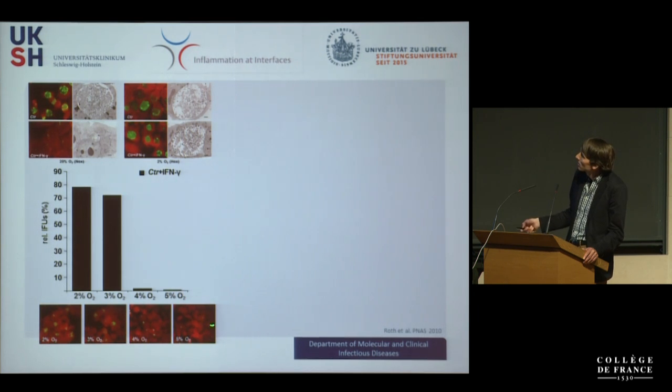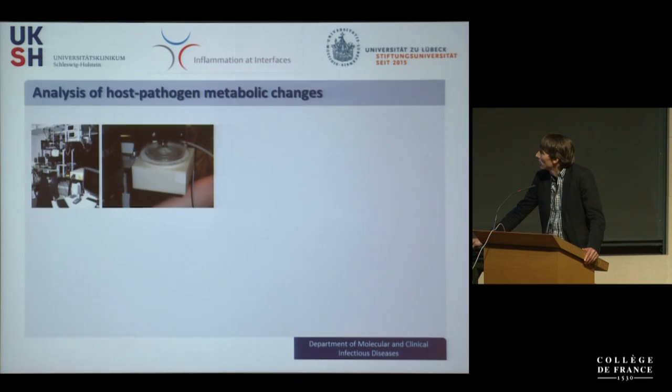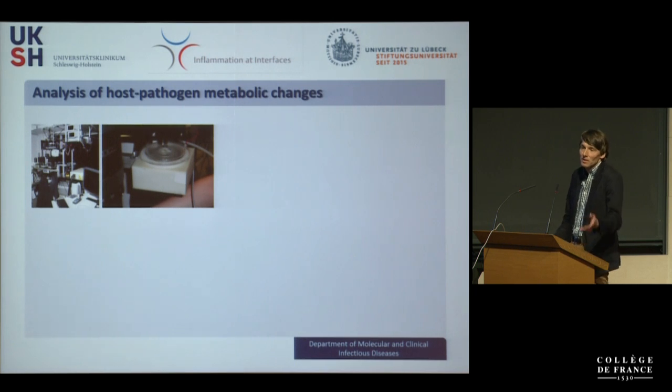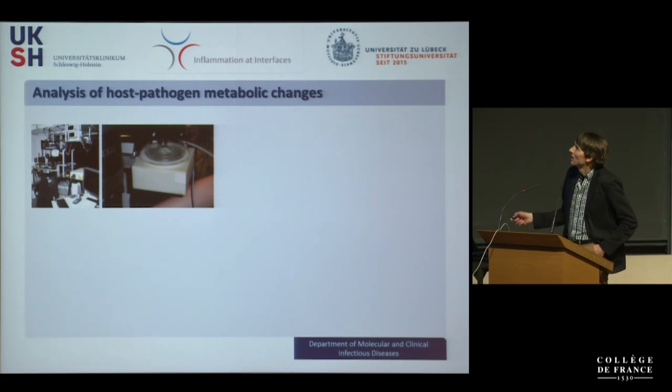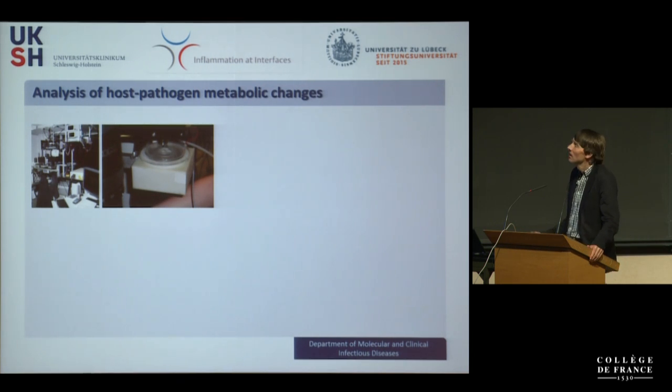This is just the background, but we thought this must have something to do with metabolism, that in those cells, of course, bacteria do not have the capability to grow as large as they would normally in a normoxic atmosphere, or if you even make them hypoxic. So we go through that, and as most of my previous talkers already said, it mostly starts with a custom-made machine, and this is a custom-made hypoxia, but also randomized, let's say, lab, where we are with guys from the physics, but also from the anatomy, and we designed such a 2-photon microscope.